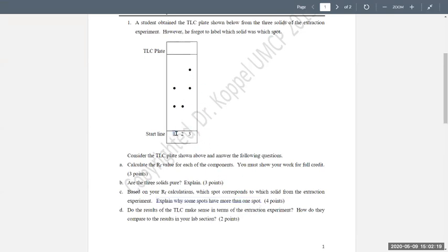So this was your first extraction fraction, this was your second one, this was your third one. So I would assume this one was your 3-nitrobenzoic acid fraction, or the sodium bicarb, and this is sodium hydroxide, or the 2-naphthol one, and this one is your 1,4-dimethoxybenzene, or the organic layer.